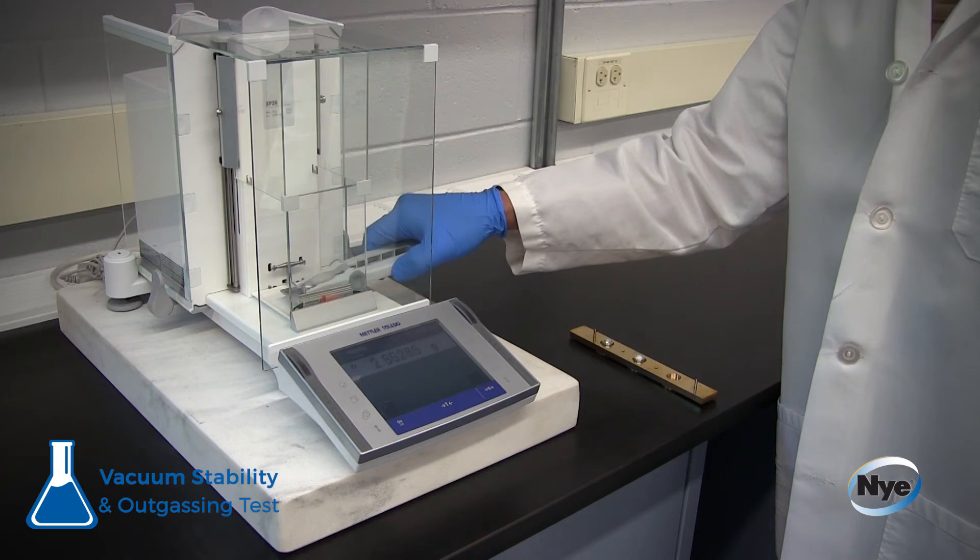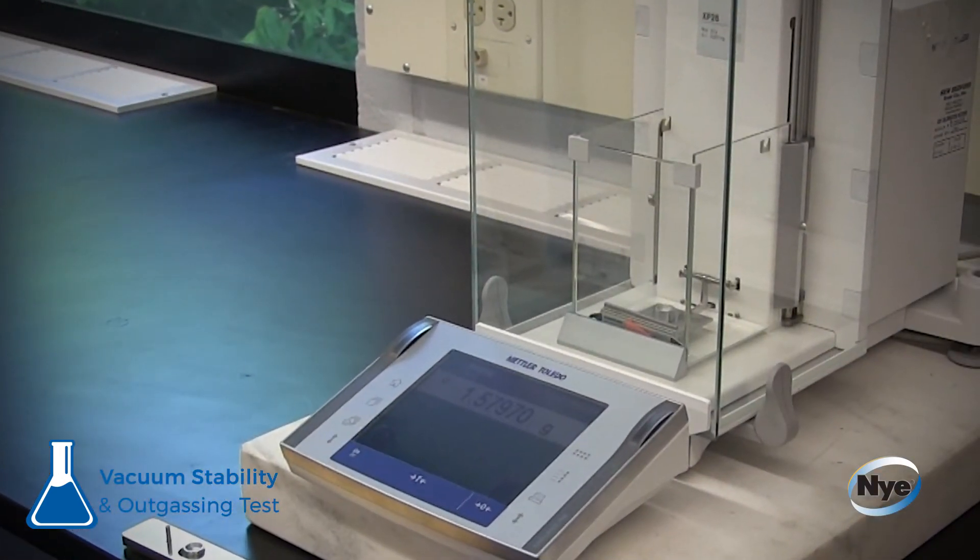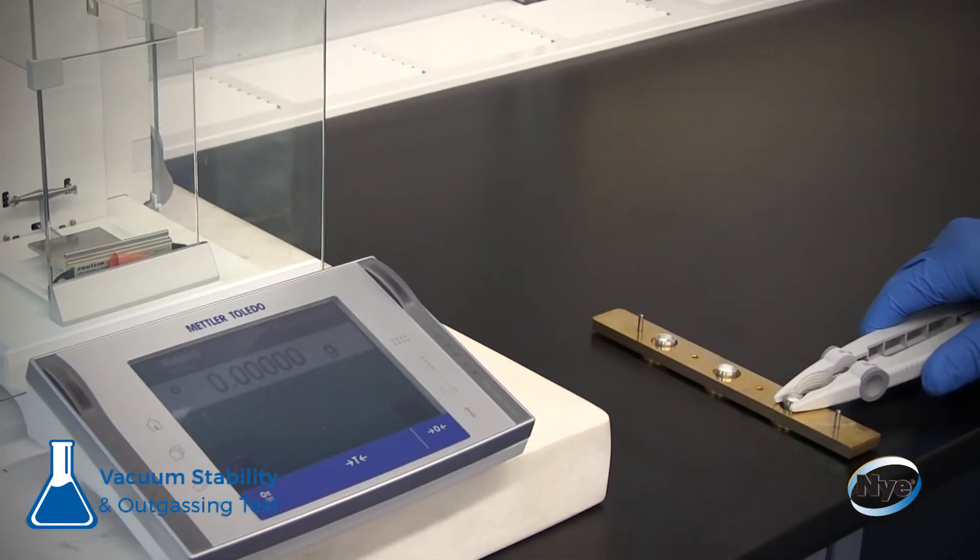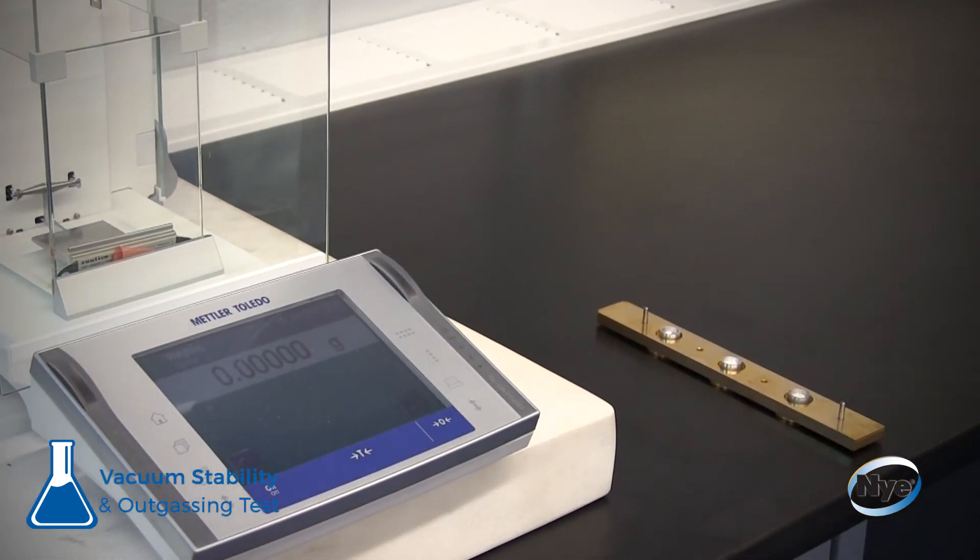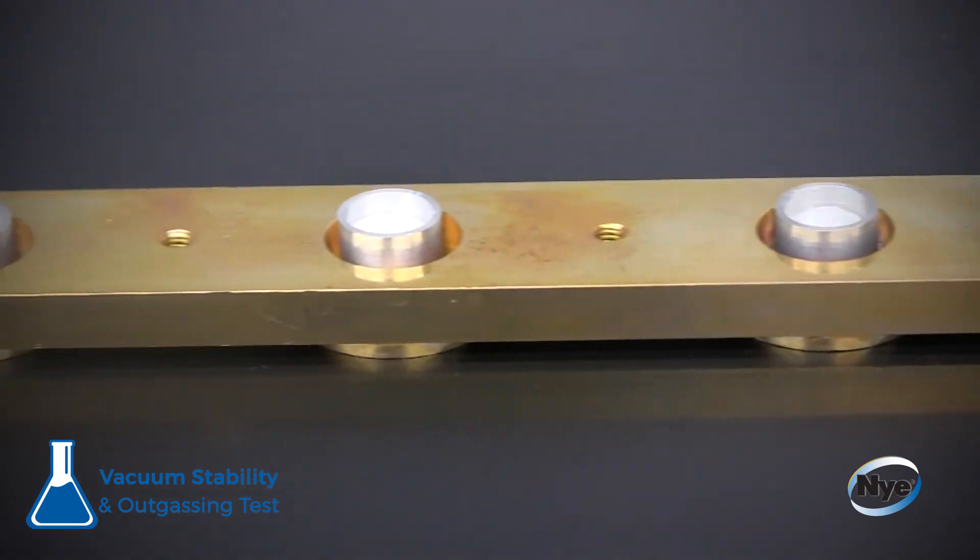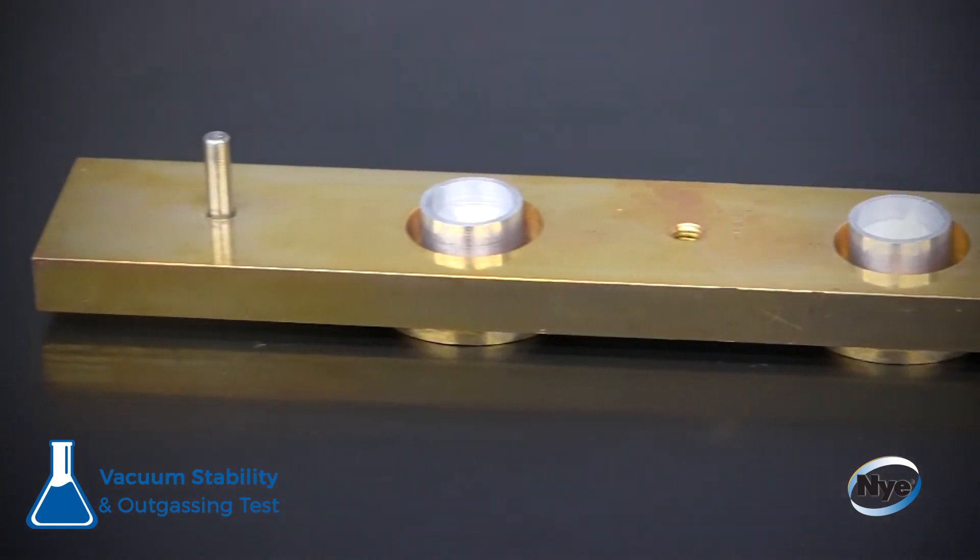From these results outgassed and the sample mass determined prior to the vacuum exposure, the percentage TML and percentage CVCM are obtained. Normally, the reported values are an average of the percentages obtained from three samples of the same material.